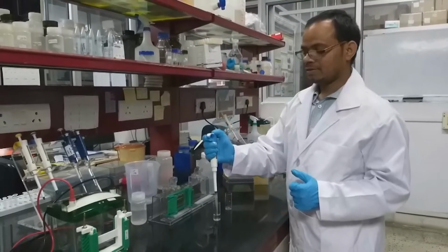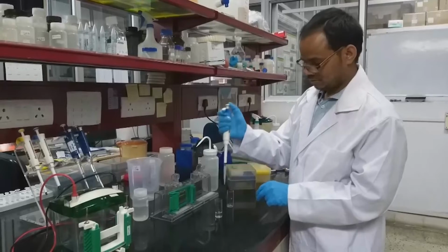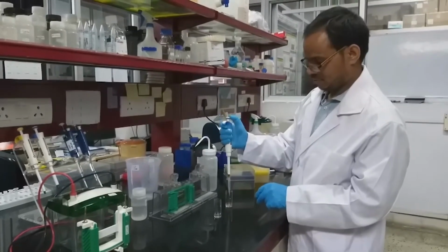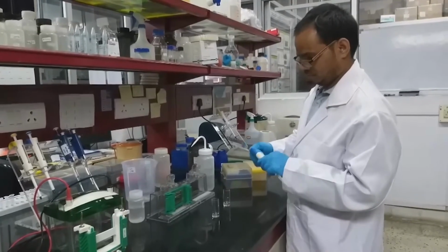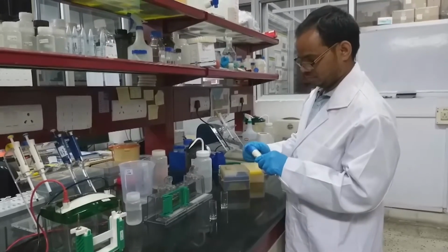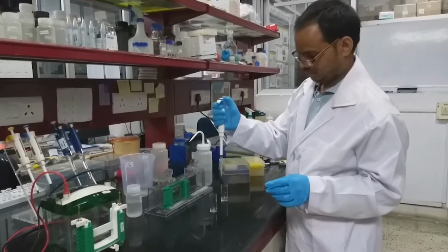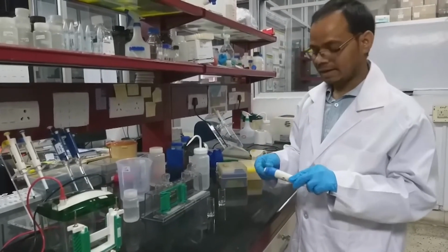You have to add 3.4 ml of water first. Next 830 microliter of acrylamide.